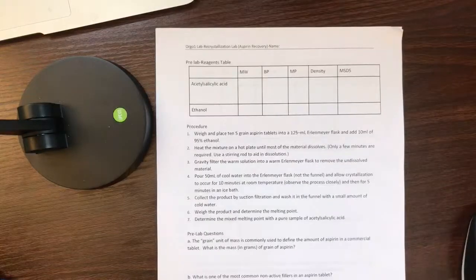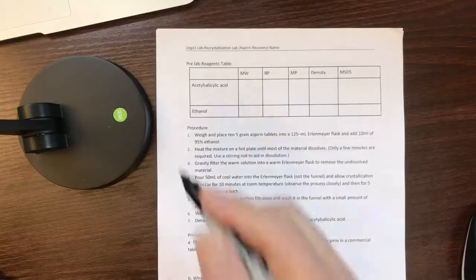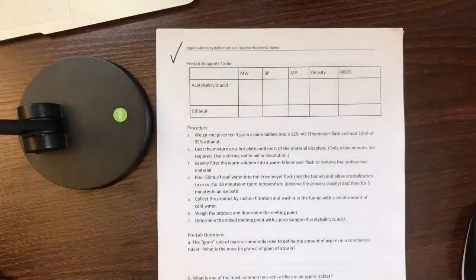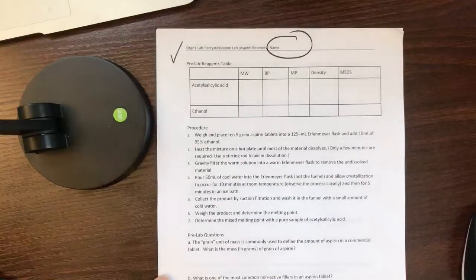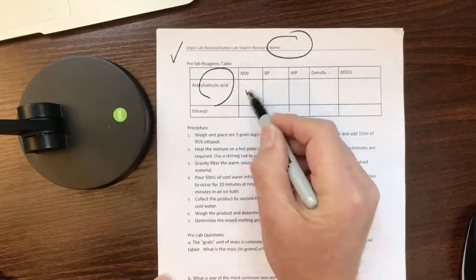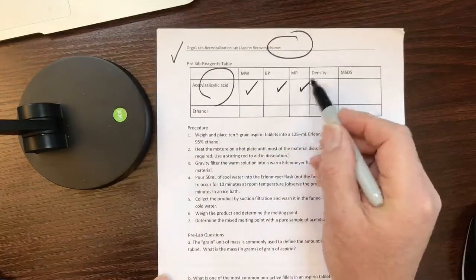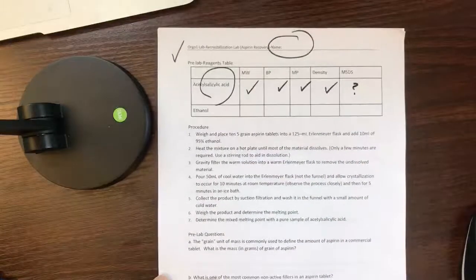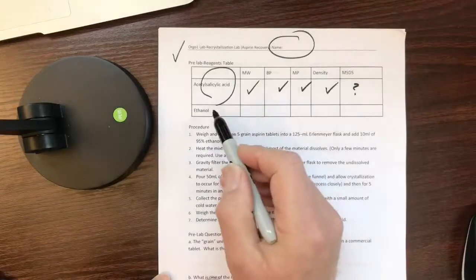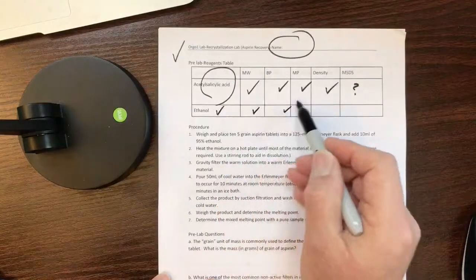As we talked before, the lab report is very easy. All you have to do is print this form. Please print it, or I have an extra copy tomorrow. When you're writing your report, make sure you write your name here, because if you don't have your name there, I don't know how to grade it. Then we look at the aspirin, see the different things for it, physical properties, MSDS, it's okay. Then we use ethanol and water, so we do the same thing for ethanol and water.